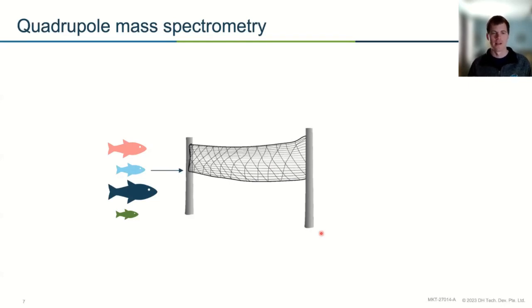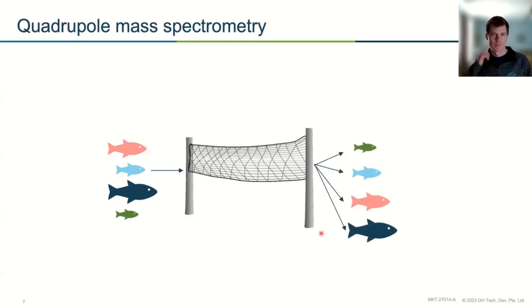And if you haven't, I like to think of this more as a filter than like a balance or scale. We are measuring mass, but the way we do it is by selectively filtering out different masses of ions using voltages and RF voltages in these almost like a tunnel is what the Quadrupole makes. So you're tuning it, and you're using a very specific set of tuning parameters to let certain ions flow through at a certain condition. So in this way, Quadrupole is great at being very fast and specific.